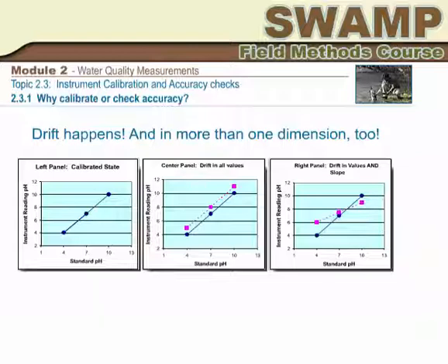If you do a 2-point calibration, make sure you use standards at values that bracket the anticipated pH in your stations. Please remember that you always have to check the instrument's reading in the standards after you come back from the field, or within 24 hours. This number will be used to calculate the drift associated with the measurement results you have obtained during the trip.